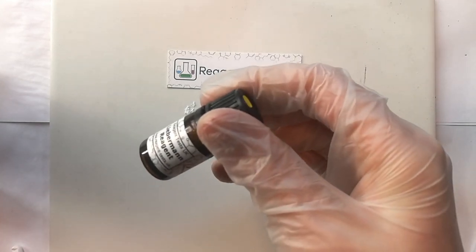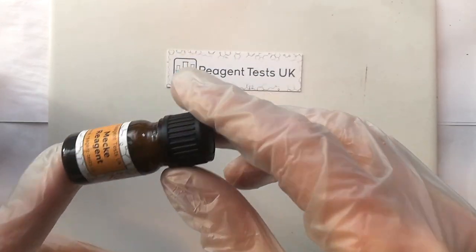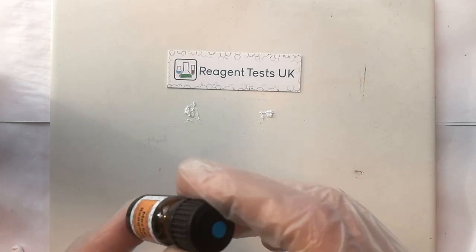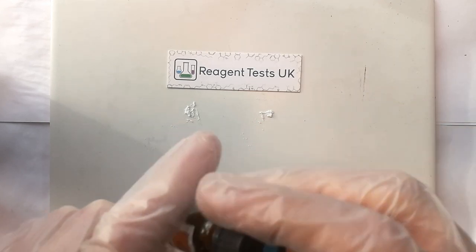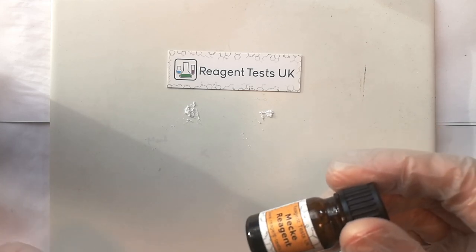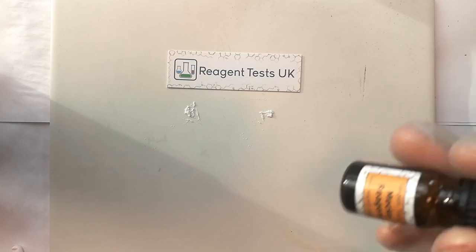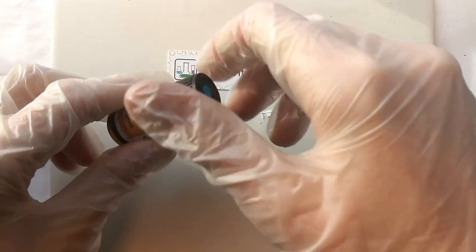Then take your reagent bottle and give it a really good shake. This helps to settle and distribute any of the chemicals inside that have settled so that it's going to be nice and even. And then after you've done that, you need to tap the bottle firmly on a hard surface so that the crystals inside will settle and are not going to fall out or be stuck to the lid when you take the lid off. It really does take a fairly firm tap to do this. Once we've done that, we can open the reagent bottle.